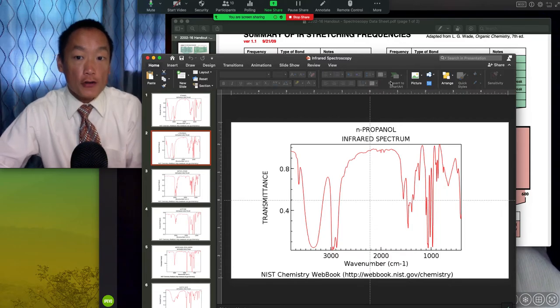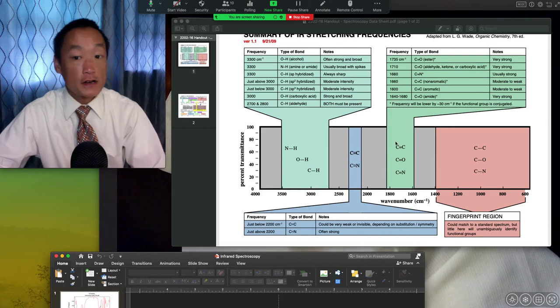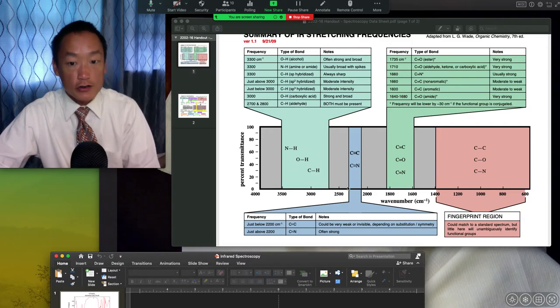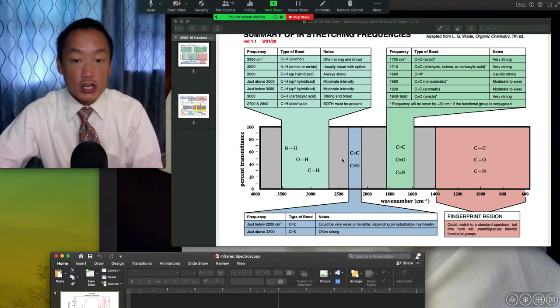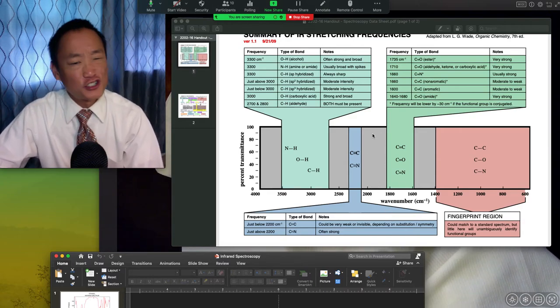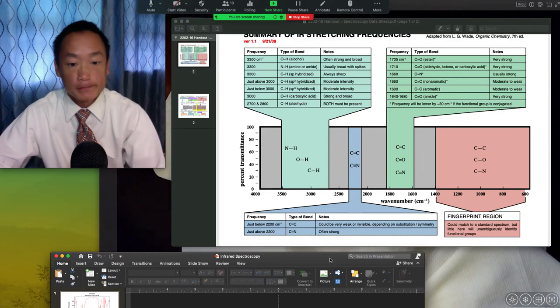There are other regions of this molecule where certain arrangements of atoms definitely appear, in between the 1600 to 1800 region, right in here at this 2300 region, right out here at this 2800-ish to 3500-ish region of the molecule. But there are also some dead zones where in most organic molecules you won't see any absorbances because there's no bonds that are tuned to that energy.